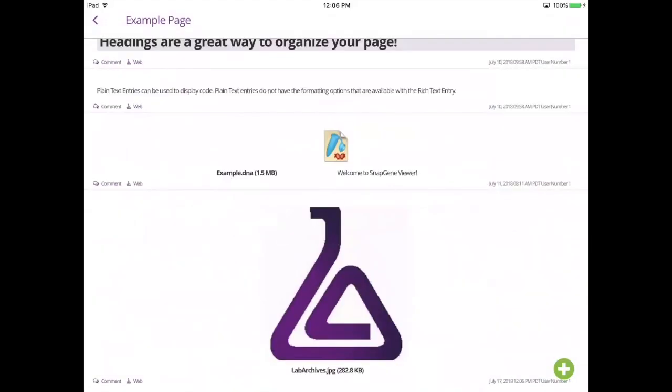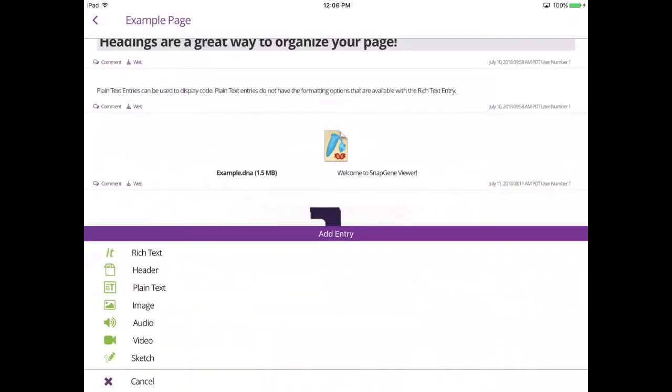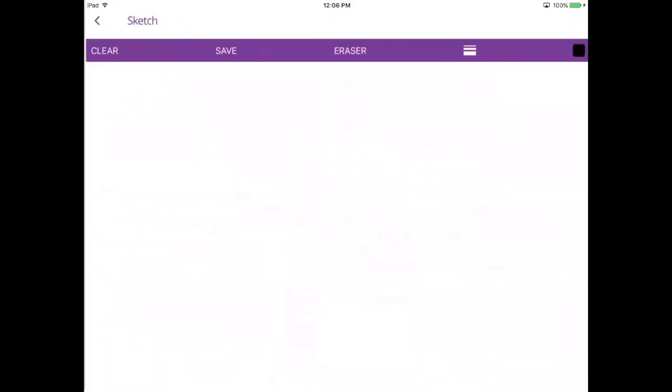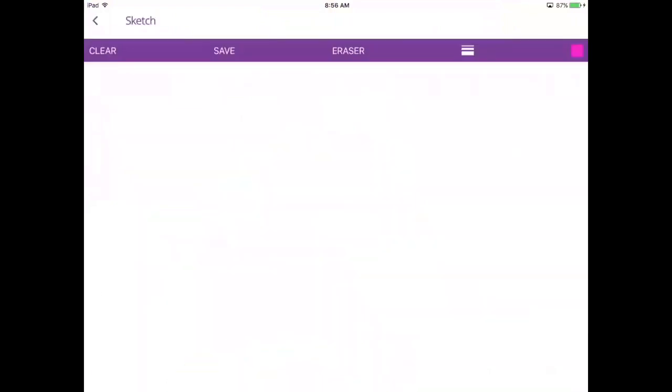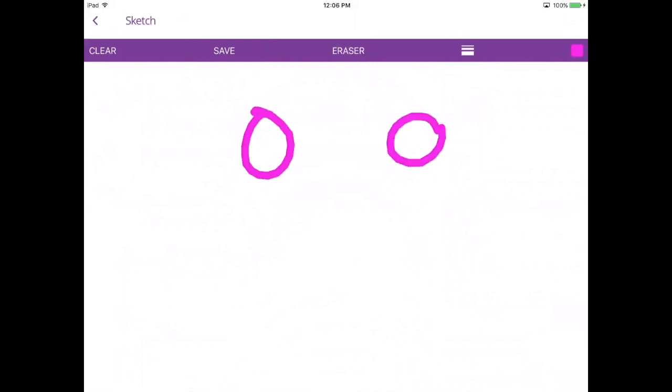You can also add a sketch to your lab notebook by selecting sketch. You can select a pen color by tapping the square on the top right, and you can change the pen thickness using the lines tool. When you are ready to save, tap save.